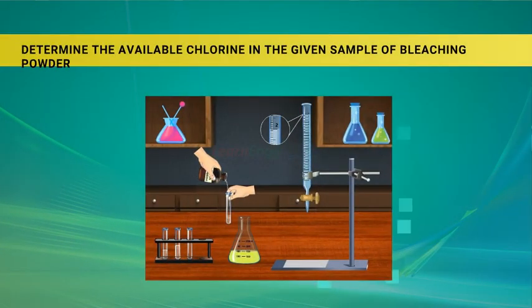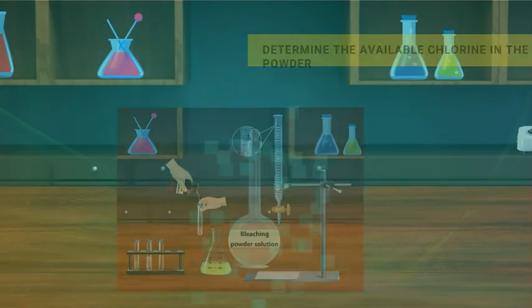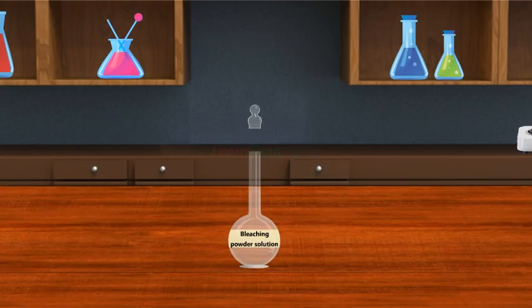Determine the available chlorine in the given sample of bleaching powder. This video explains about the determination of available chlorine in the given sample of bleaching powder.